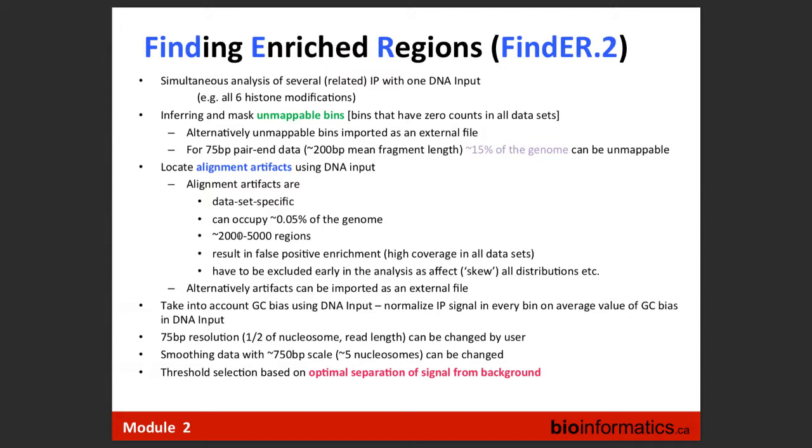That's a problem. So instead of input having reads which are randomly and nicely distributed, in input we see something like that. We perfectly see nucleosome positioning. And if we have MNase digested data and we do a Fourier transform, for example, to analyze the frequency, the periodicity in this data, we perfectly get single nucleosome periodicity. So let's just be aware of that.